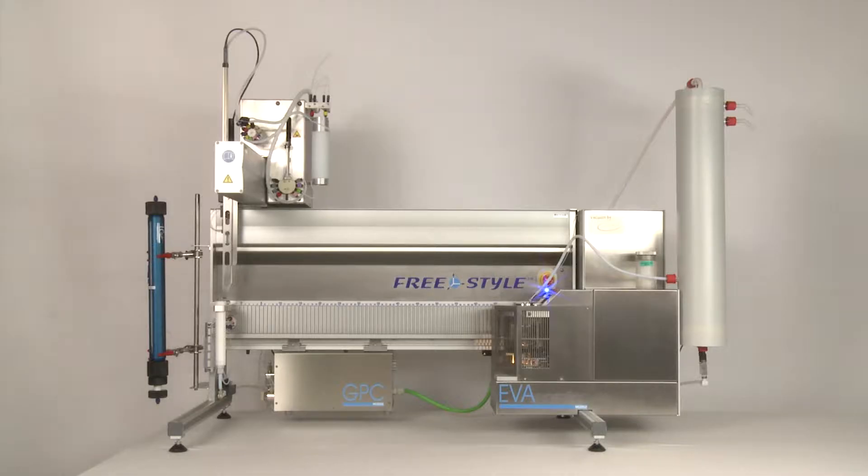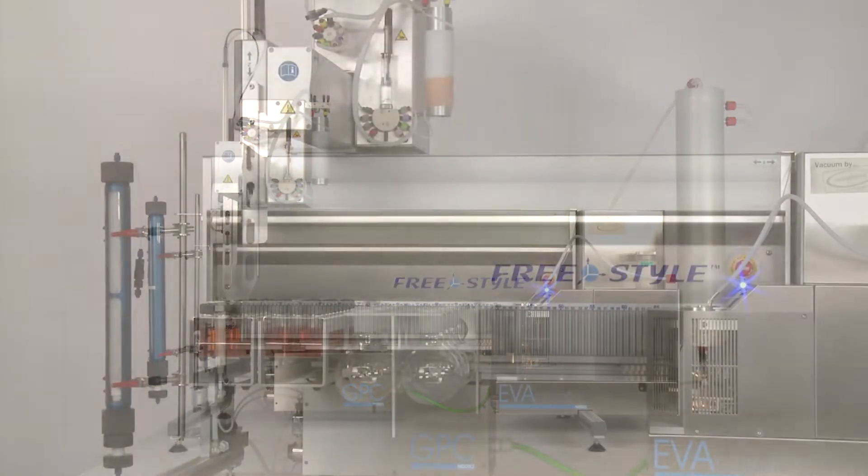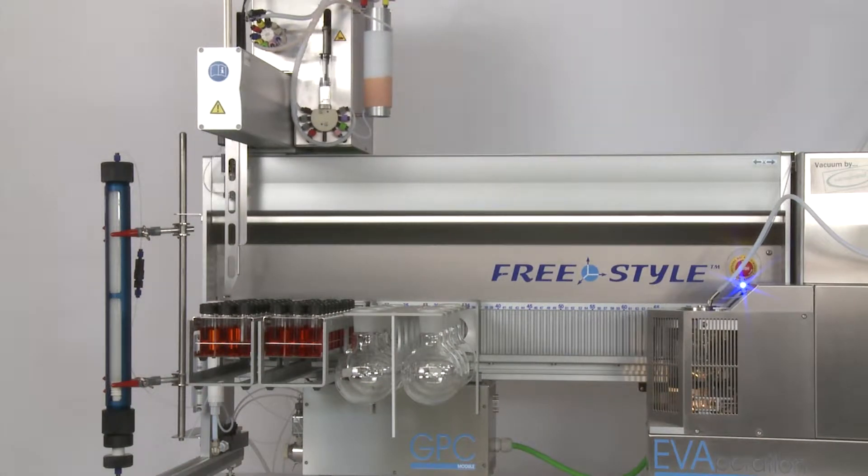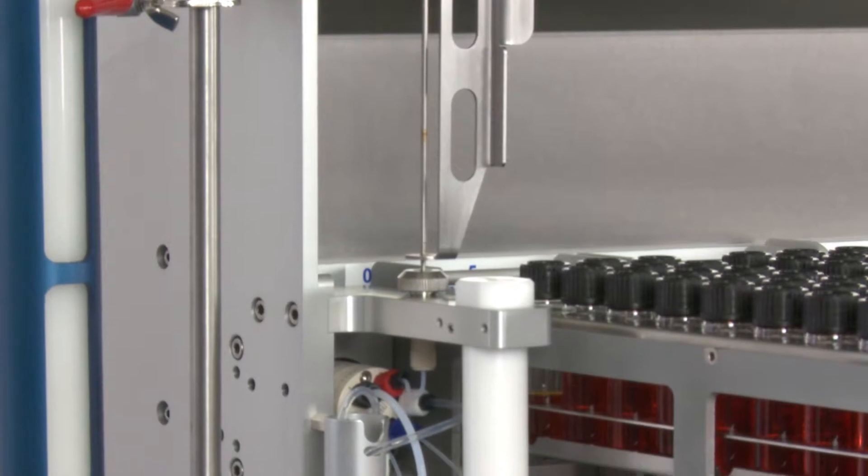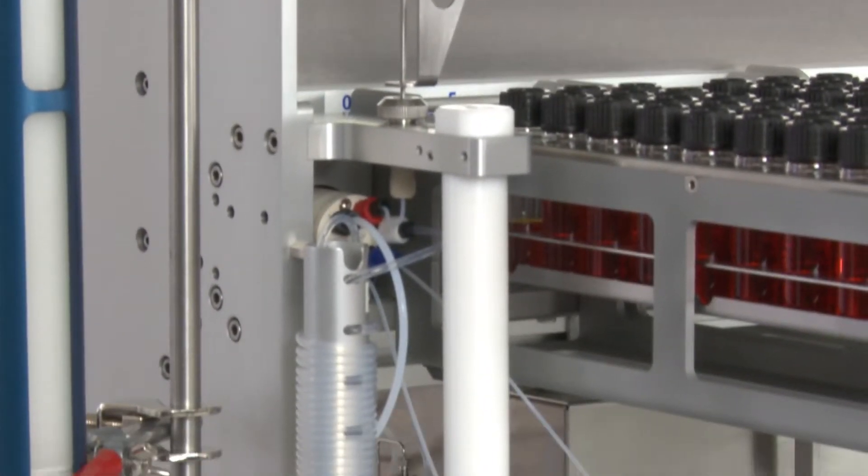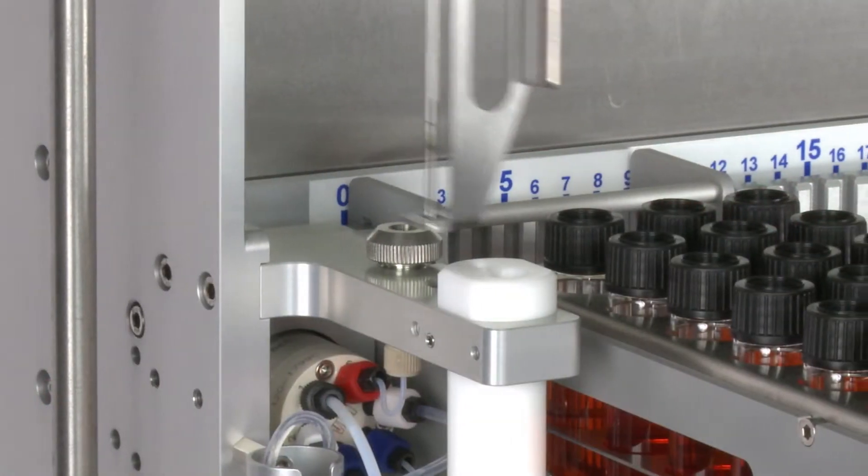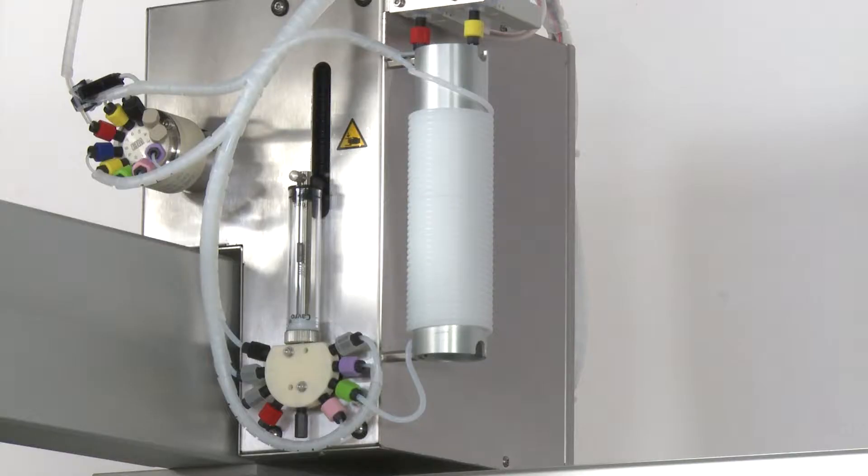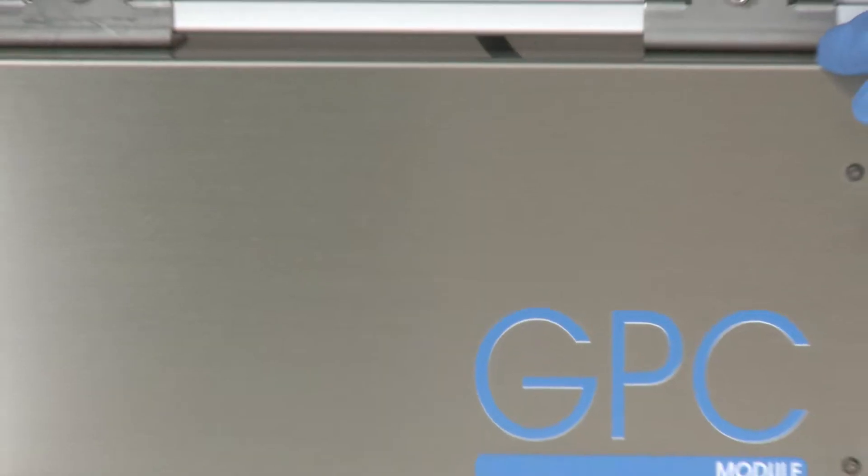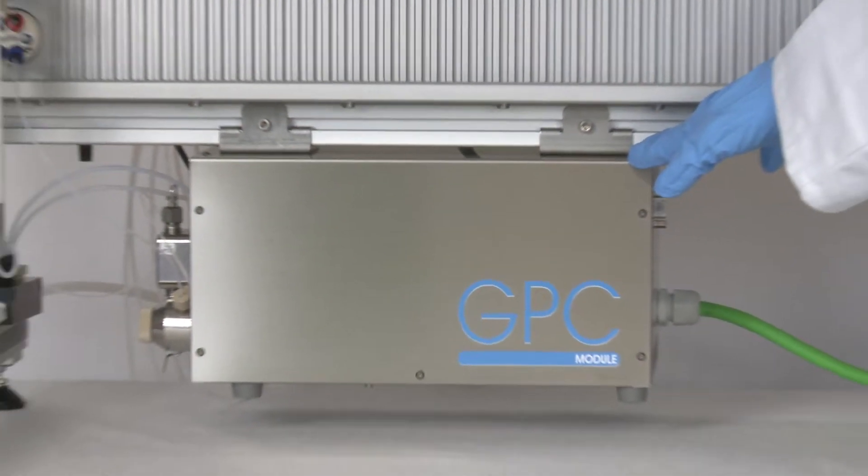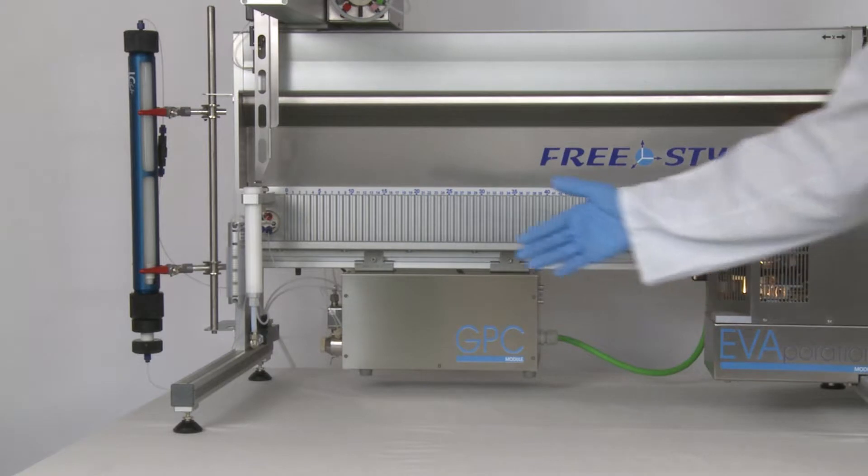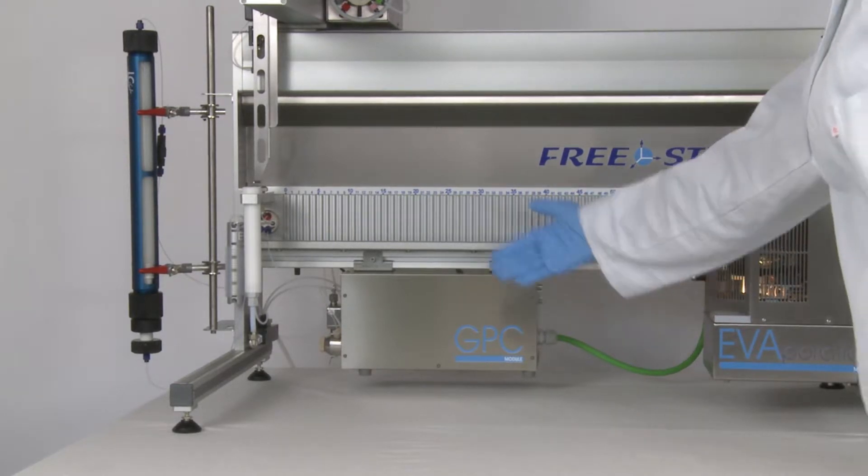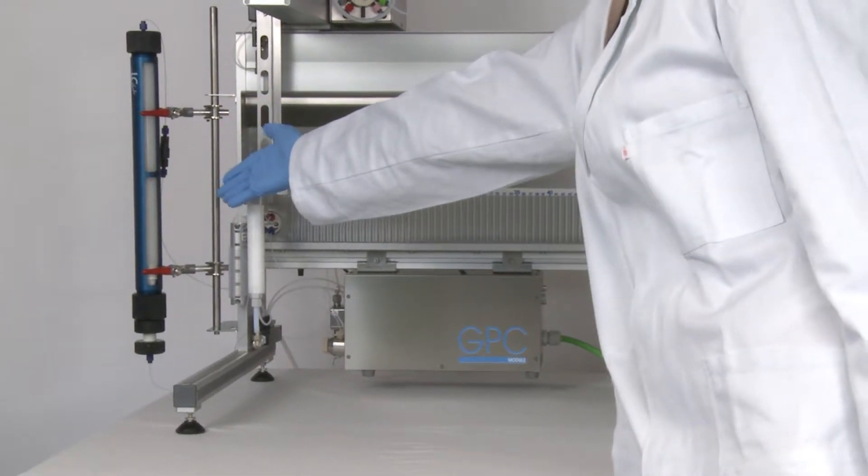In this video, we will demonstrate the FreeStyle BASIC with the GPC module. This system can be configured to be used with all worldwide established methods in sample preparation, for example the DFG-S19 or the USEPA-3640A. The GPC module consists of two parts, namely the FreeStyle BASIC with the GPC module and the LCTech GPC column.